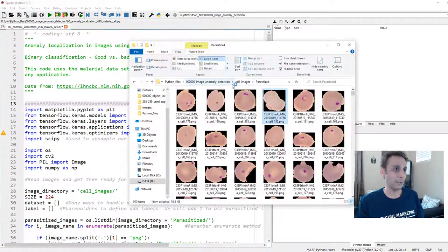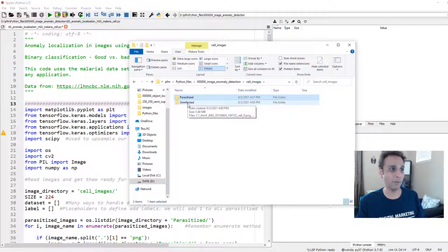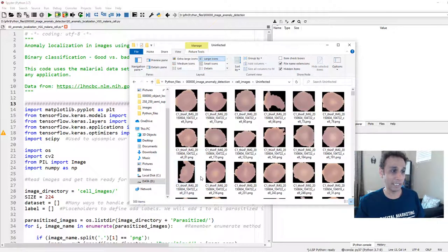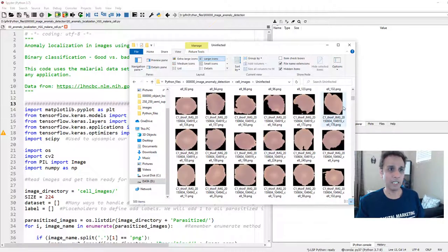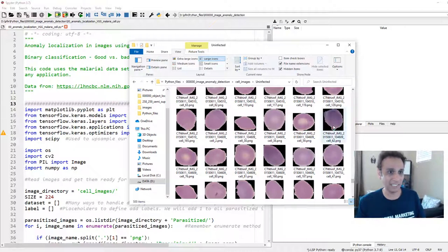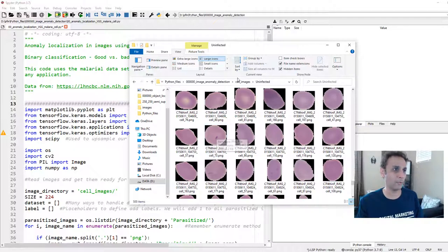Within 'cell images' there are two folders: one labeled 'uninfected' and the other 'parasitized.' If I open 'uninfected,' you can see 500 images — these are all uninfected cells, so they look as clean as possible. There are some that could questionably have a parasite, but someone labeled them as uninfected, so we'll work with that.